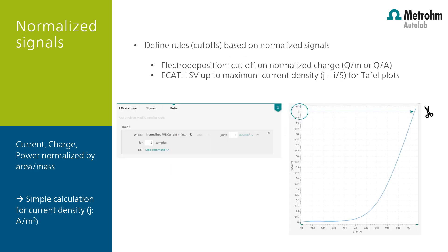In this INTELO 1.4 version, it is also possible to set rules for the normalized signals. For example, you can stop the procedure if the current density reaches 1 mA per square centimeter. Two other examples are during electro-deposition when you want to stop the deposition if the charge per square meter reaches a certain value, or in electro-catalysis if you want to run a linear sweep up to a certain current density for making a Tafel plot. This can all be programmed in the rules section of the measurement command.